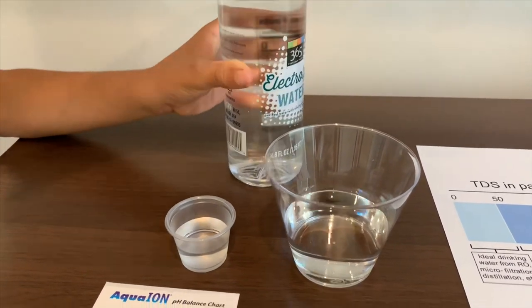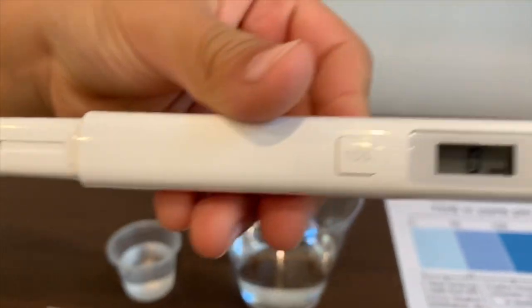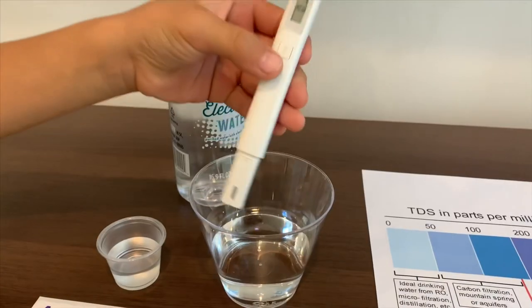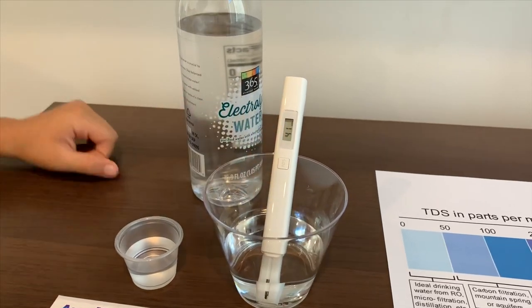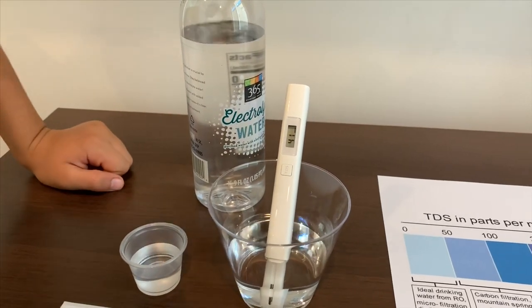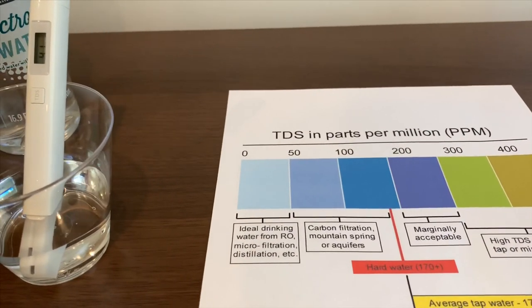Let's turn on the TDS tester. Make sure it says zero. Now let's pour it in — it is 41. It is ideal drinking water.